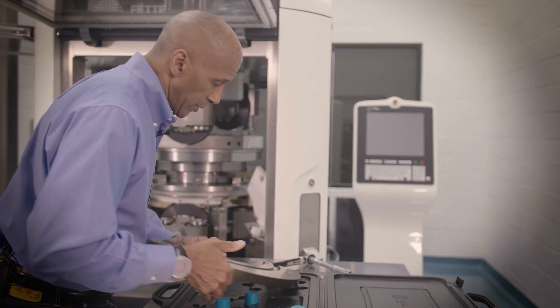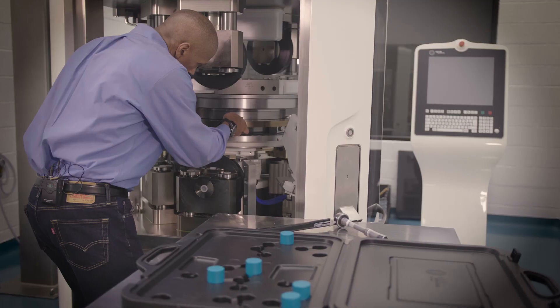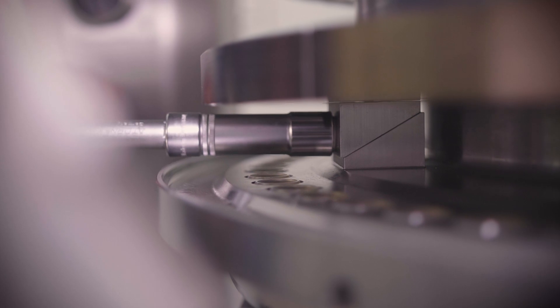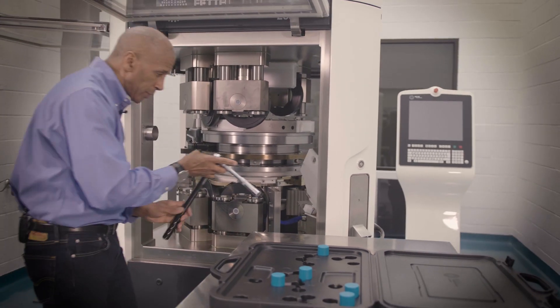The installation is very easy. We place the Segment into position. We utilize two locking stations. Secure it. Repeat that to the following locking station. So with the installation of the Segment, it's very easy, very fast, efficient.